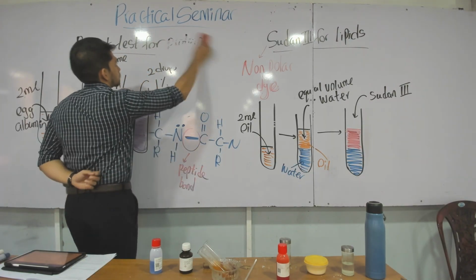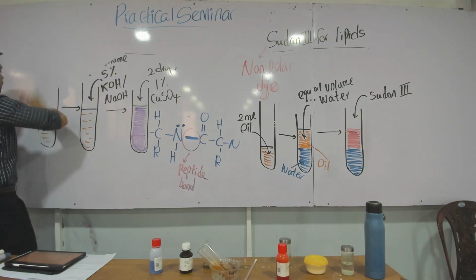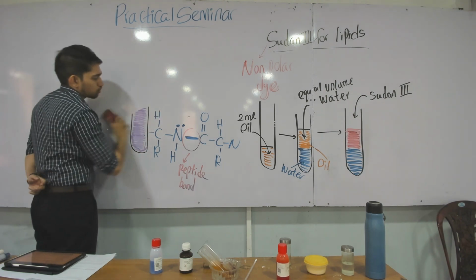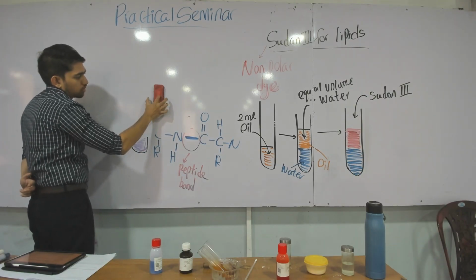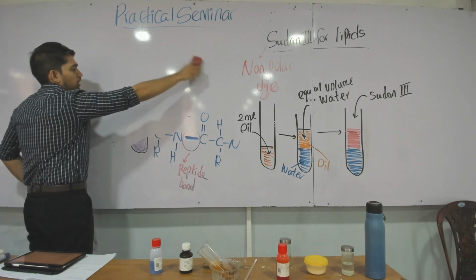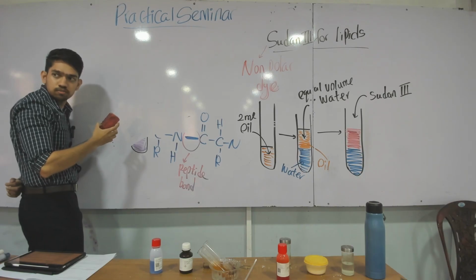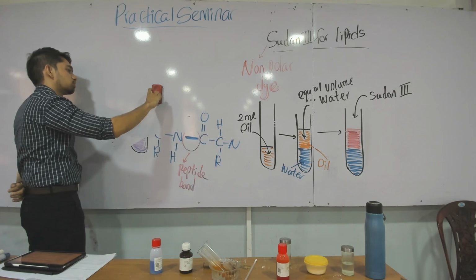If we discuss microscopes, a microscope is an instrument that we use to magnify things. The main function of a microscope is to create a bigger image. If I am doing a 10 times magnification, you are going to see an image 10 times bigger. But is it a real image? For physics, real images versus virtual images. Usually the images we produce using microscopes are virtual.